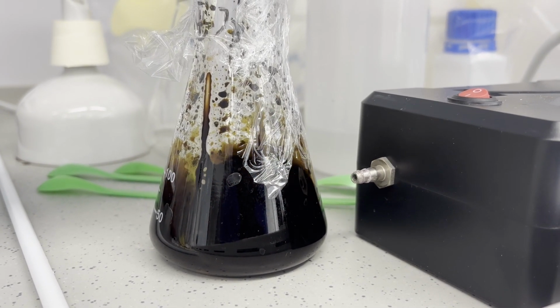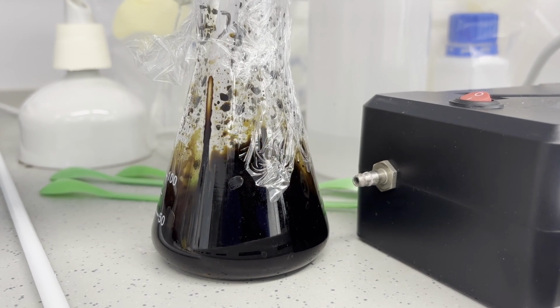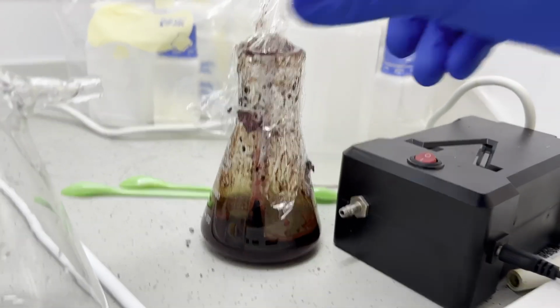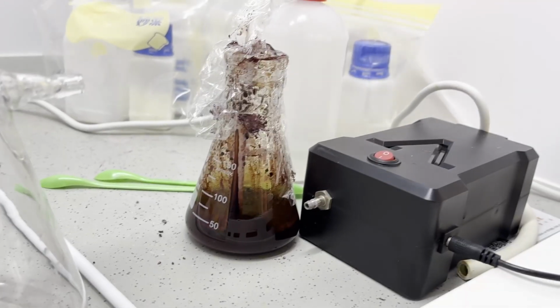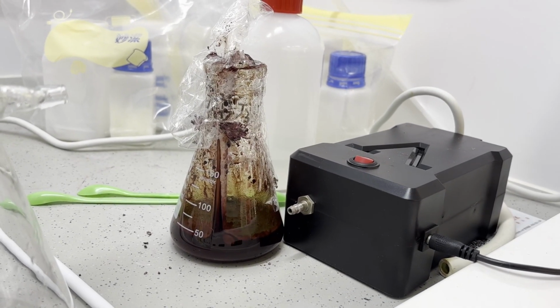The mixture is then filtered, and the residue is mixed with 50 ml of water along with 1 ml of hydrochloric acid and filtered again. The filtrate this time shows a bright yellow color. 20 ml of hydrochloric acid is then added along with some ethanol to precipitate the product. The yield was tiny at 0.14 grams, but at least I finally had some yield.